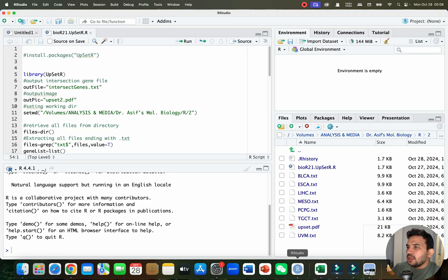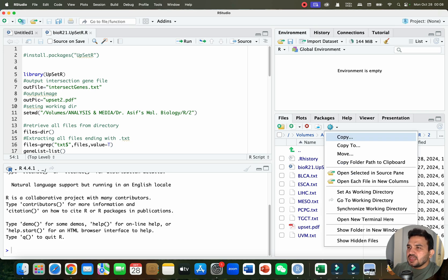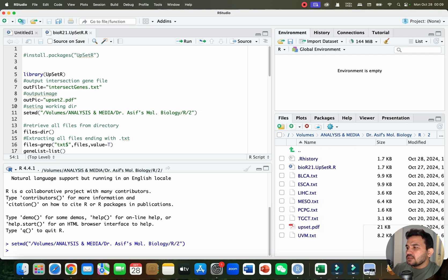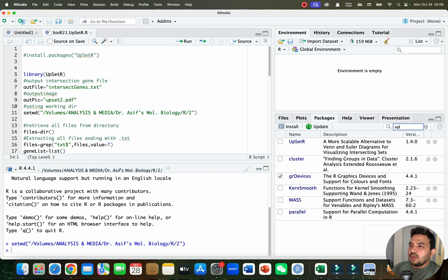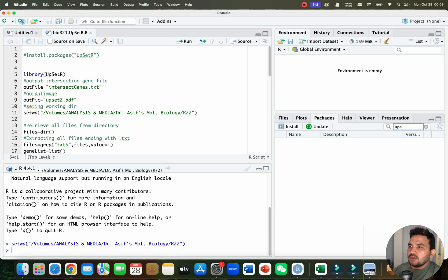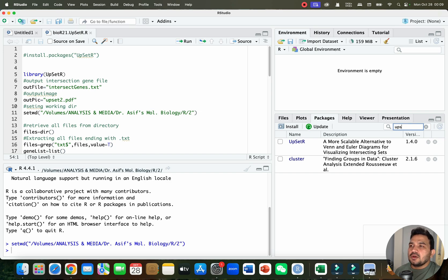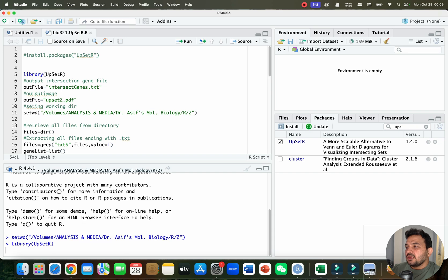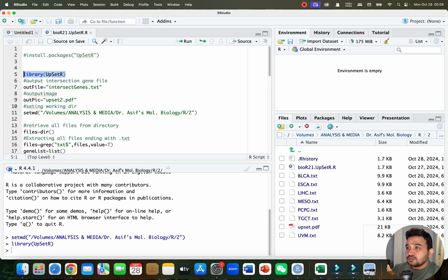Now let's go back to R and perform how we can draw an upset diagram using our dataset. I am in folder number two, so let's make this folder our working directory. I will simply click on 'Set as Working Directory' — you can see this folder is now set as working directory. Before drawing the upset diagram, you need to install the UpsetR package. I have already installed it, but if you haven't, you can install it and then activate it using the library function.